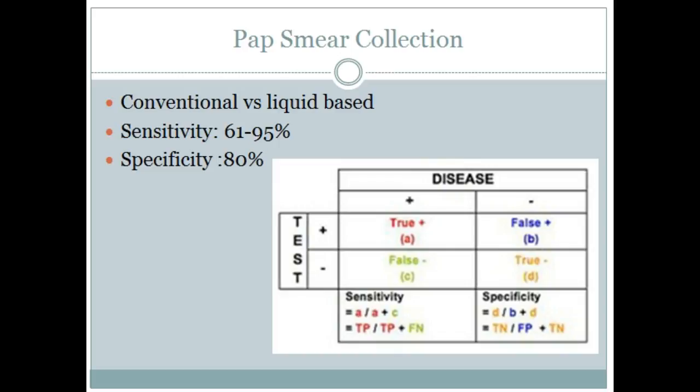And if there were other substances present, such as if she was on her period, looking under the microscope, you're having to kind of weed through all of that to actually look at your cell type. Whereas now almost everyone is using liquid-based collections, and so it's a lot easier to filter through extracellular matter that's not actually cervical cells that we're looking for.